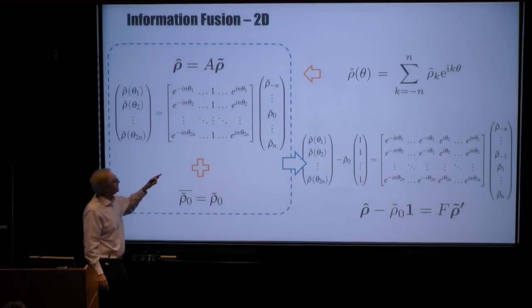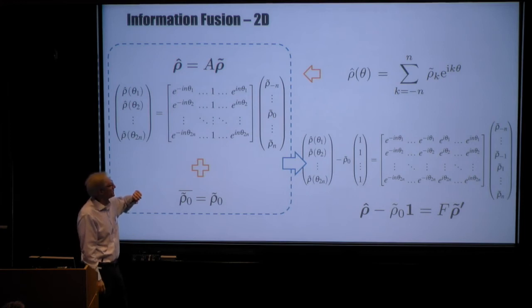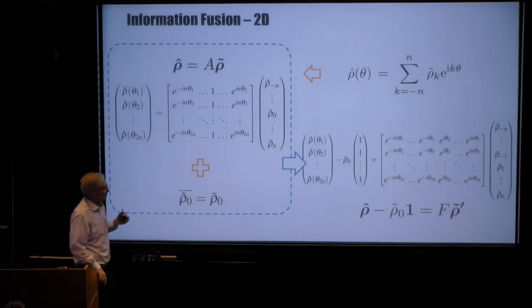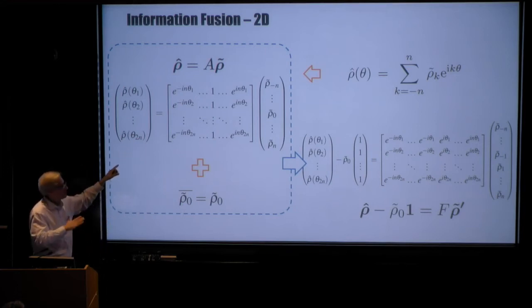Then we're going to take this expression and manipulate it a little bit so that on one side is all the measured data, and on the other side are the variables that we want to obtain. For example, the Fourier values going around the circle in Fourier space, that's actually what EM is providing in this planar analog.